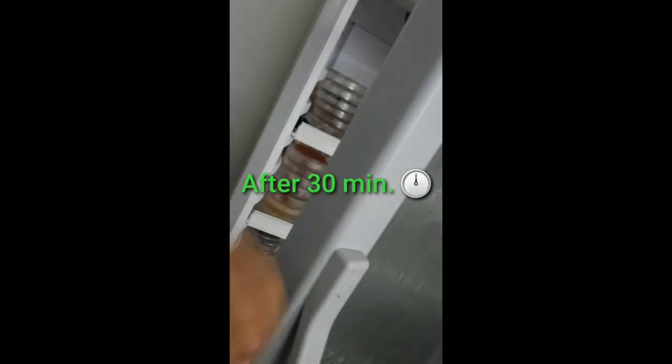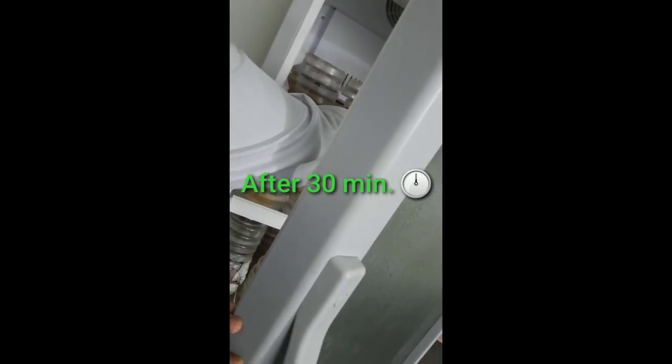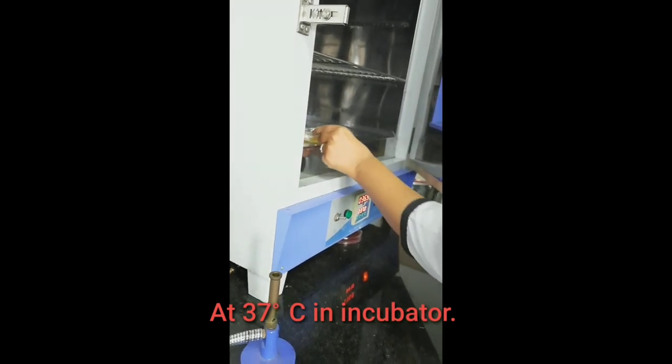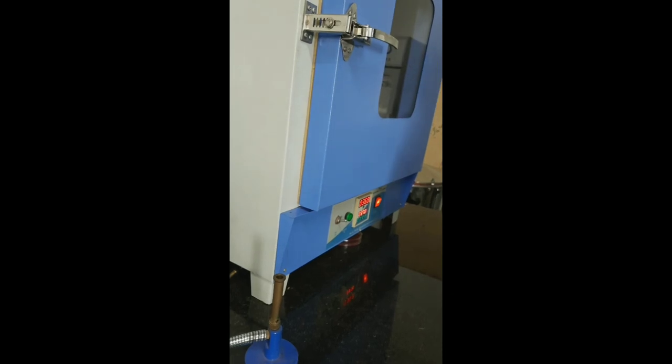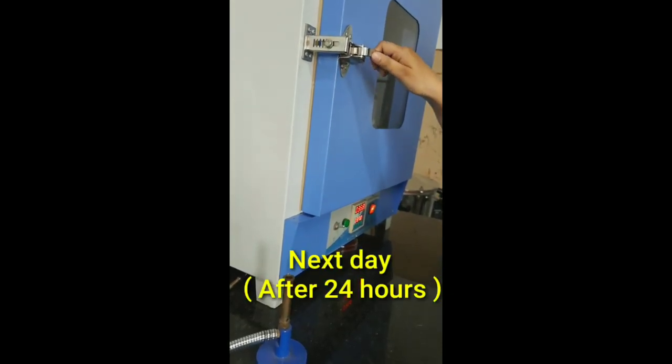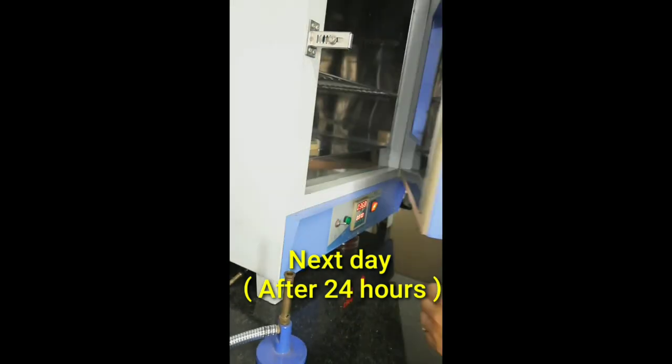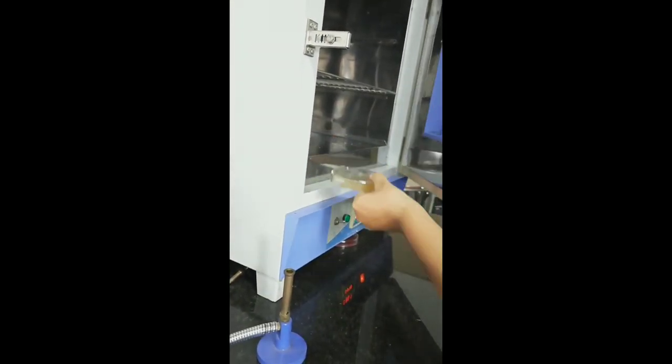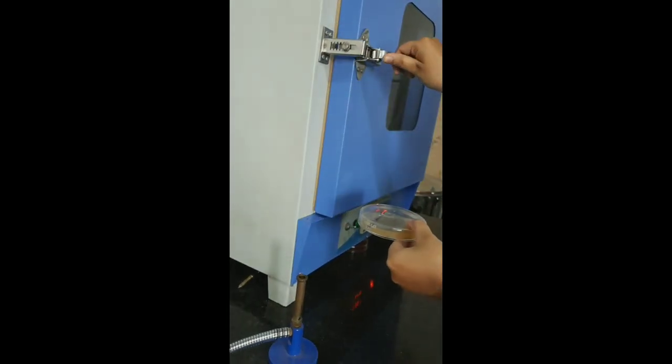After 30 minutes, we have to take it out and place it in the incubator without disturbing. In the right position we have to place it in the incubator at 37 degrees Celsius for 24 hours. On the next day, we have to take out our plate and observe the zone of inhibition.